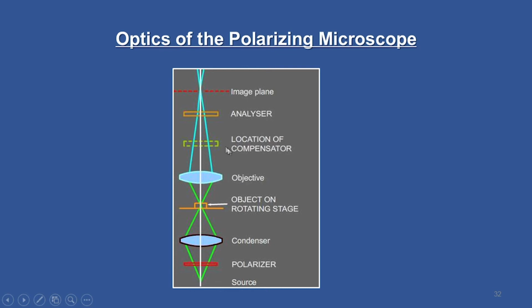Here we will see what the function of a retarder is. The retarder gives a specific phase shift between the ordinary and extraordinary rays, and then you get the relative retardation, because the ray coming out of this specimen is compared, and you get the material characteristics. Then you have the analyzer and finally the image plane. At the image plane, both rays are interfering and producing the contrast.